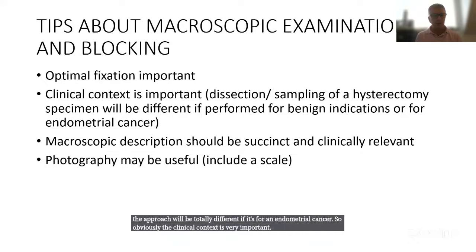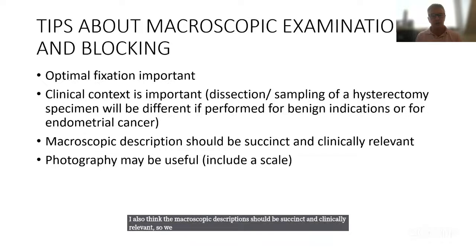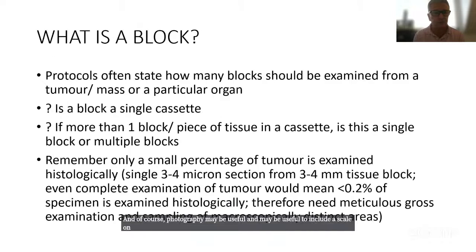I also think the macroscopic description should be succinct and clinically relevant. So we don't need a lot of things which are not clinically relevant in the macroscopic description. It should be succinct and to the point. And of course, photography may be useful, and it may be useful to include a scale on photographs.